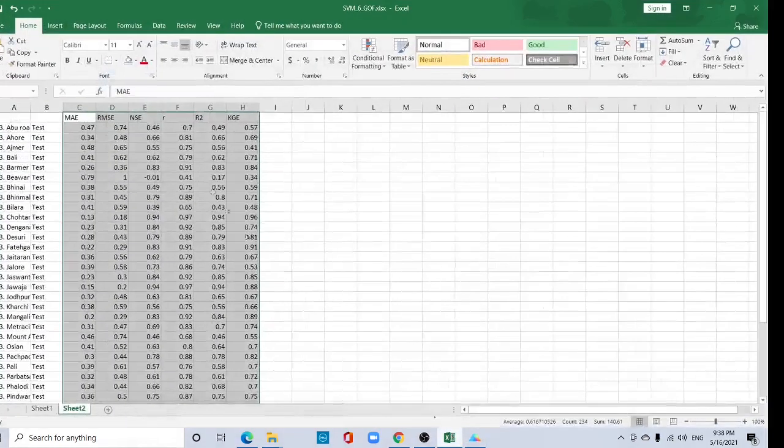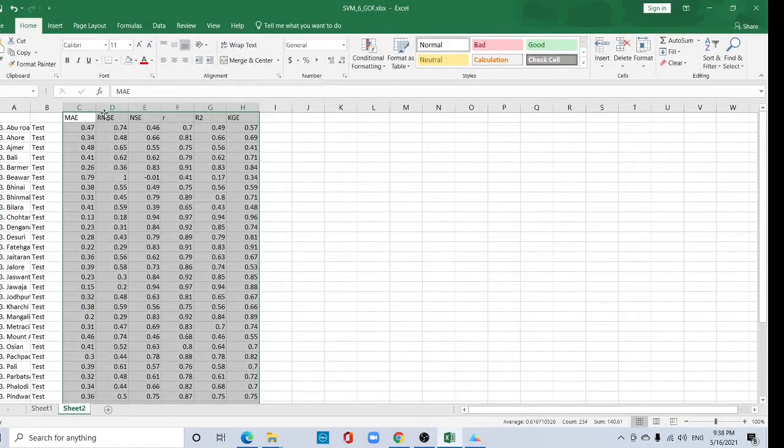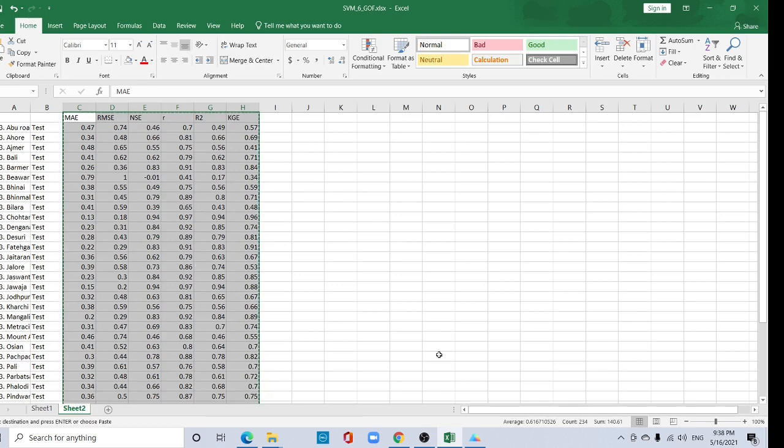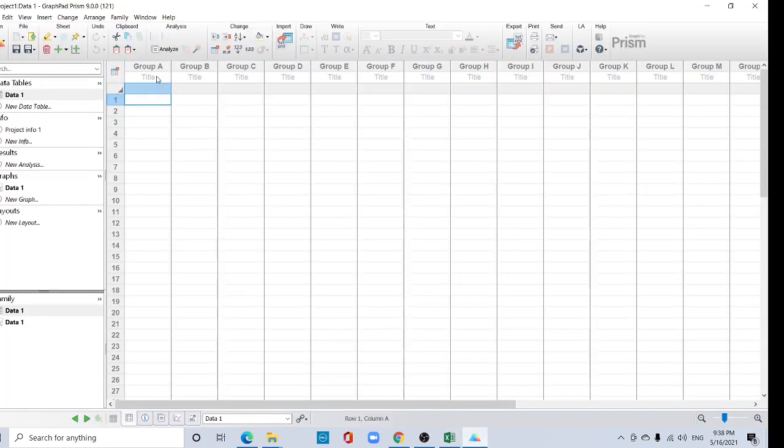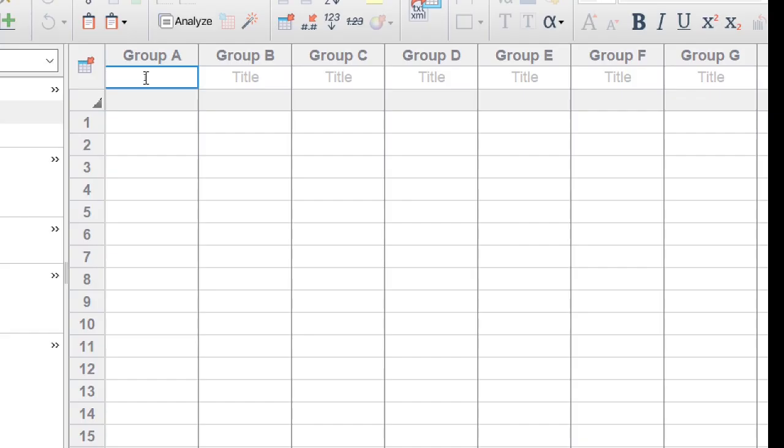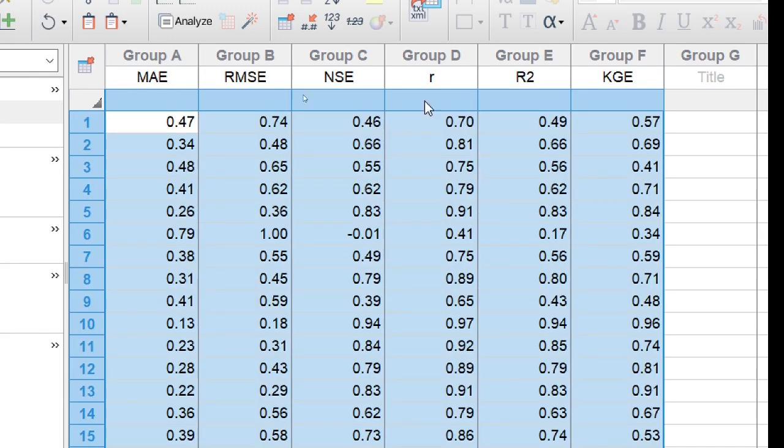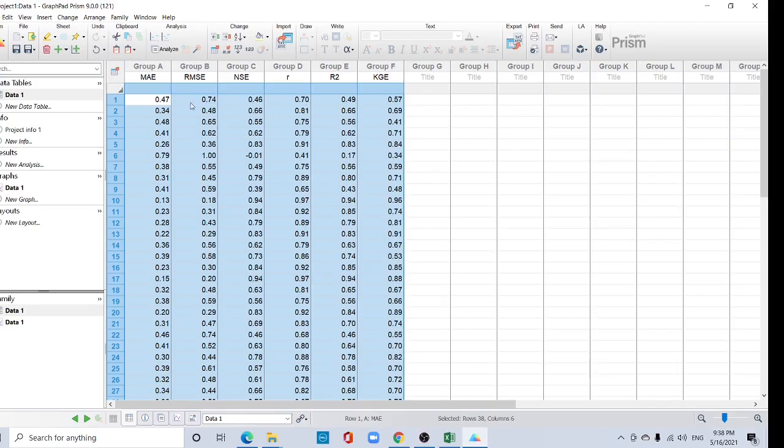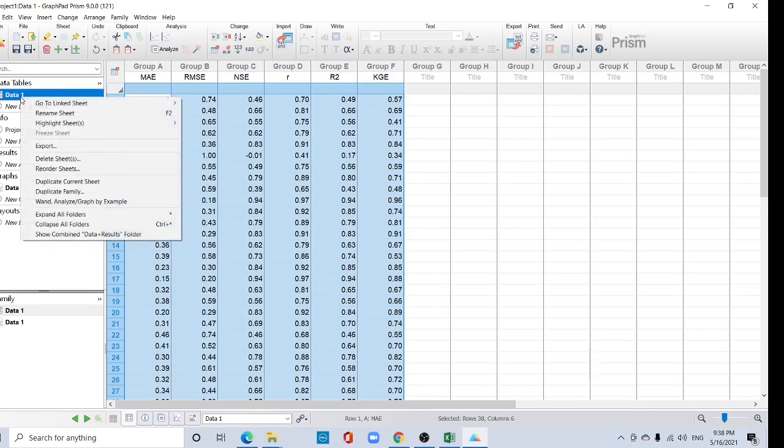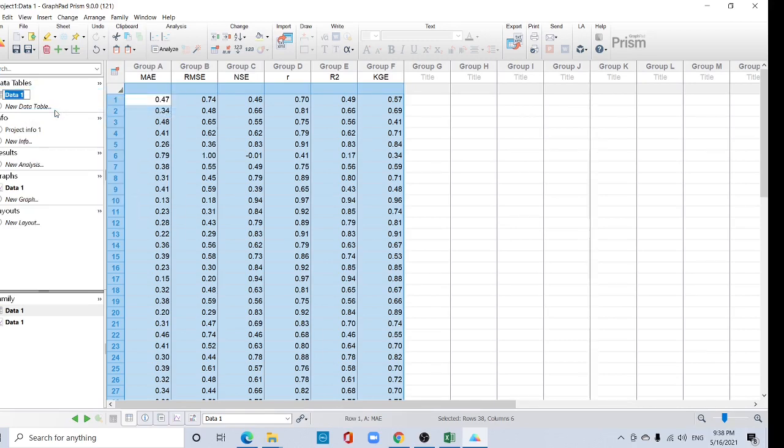Copy your data. I have this data, copy it and paste here using Control V. Okay, this data you can rename it. Right click here and rename sheet.